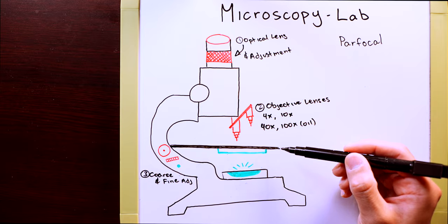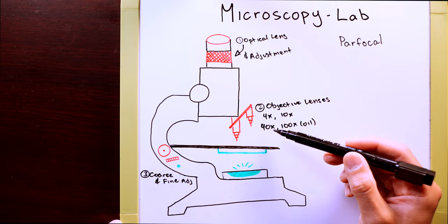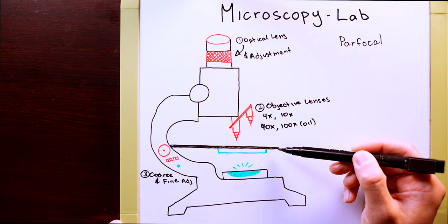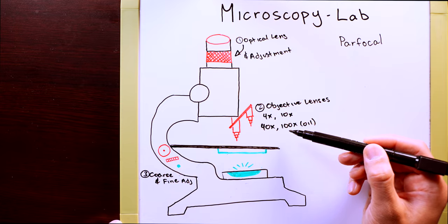It's going to be very important that you only use the coarse adjustment with the 4 and 10x. Because if you use the coarse adjustment with the 40x or 100x, what could happen is you'll bring the slide and slam it into one of these lenses and break the microscope.